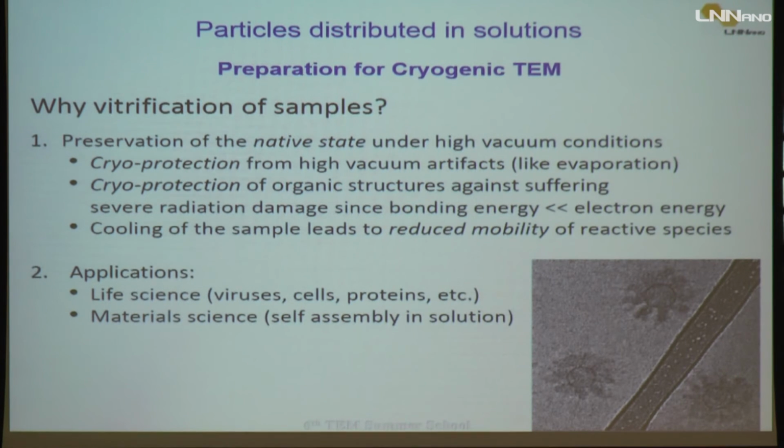With the cryogenic preparation, you protect your sample from the high vacuum artifacts related with the evaporation of part of your sample.